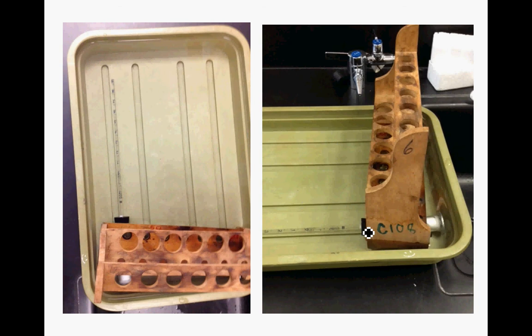So here's what I was saying about the test tube rack. This is the top view, and then here's a side view. So just put the whole test tube rack down into the water bath so that it holds the respirometer underneath the water. After that 10-minute incubation time, you're going to move that and adjust it so this is also submerged. So the whole thing is submerged underwater.